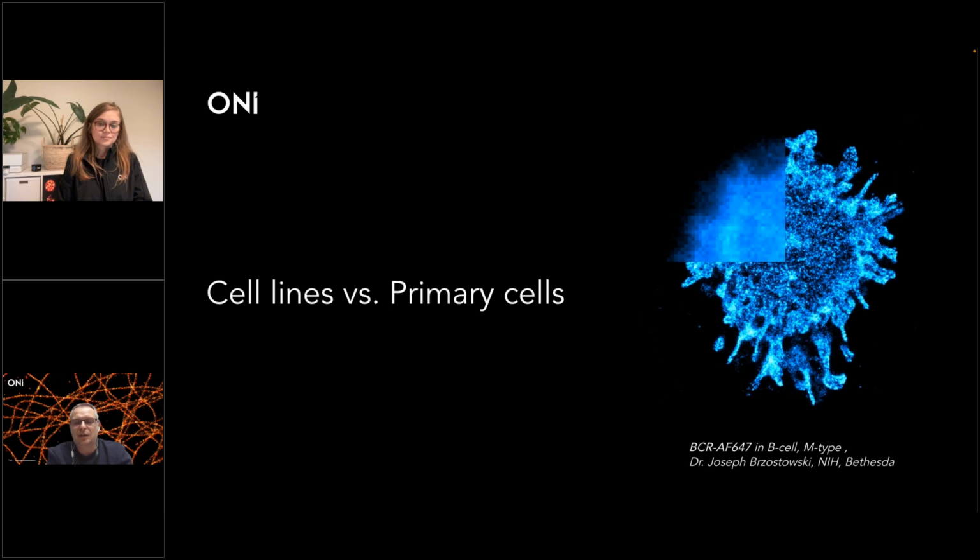One is just using a light fixative, like PFA, paraformaldehyde, but the other one is a combination of paraformaldehyde and glutaraldehyde. Which of these two fixations is the best for your cells, you will need to actually try out. The reason why I'm saying this is that by using any of these fixations, you can alter the epitope of your proteins, and then maybe your antibody will not bind to it.